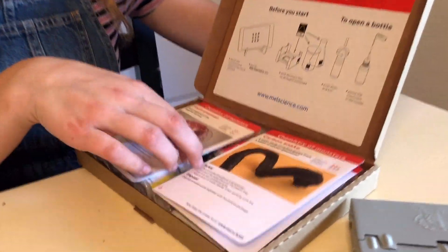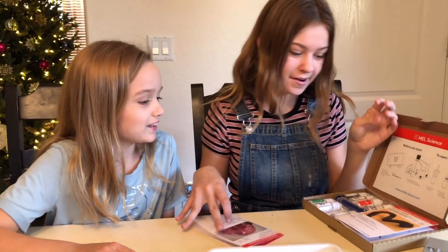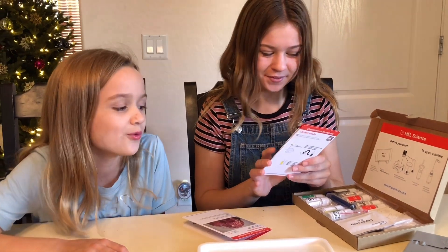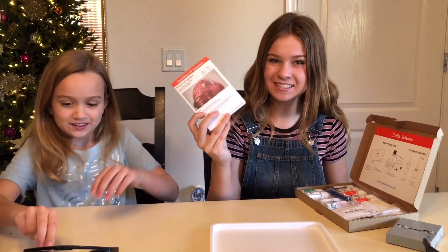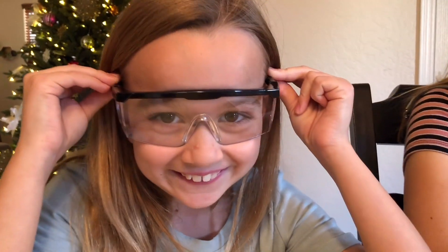Here's all the stuff that we have. We have a foam eruption and a carbon snake. We're doing the foam eruption first. Let's get started - make sure we put on our safety glasses. Look at all this stuff!